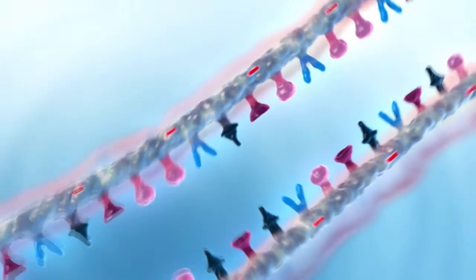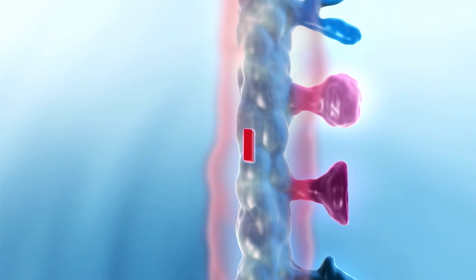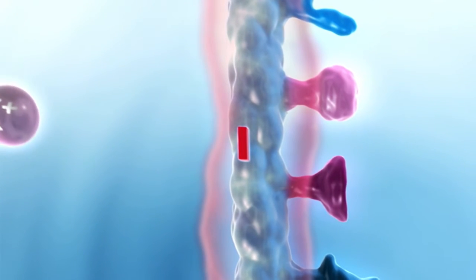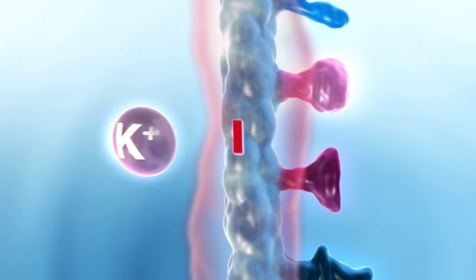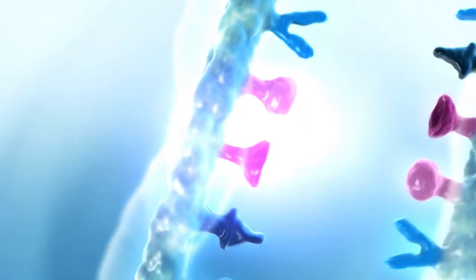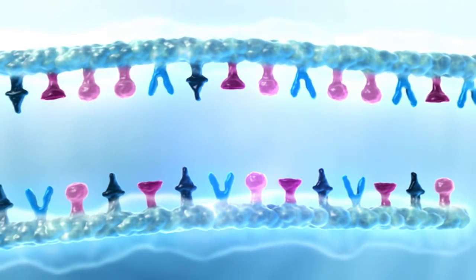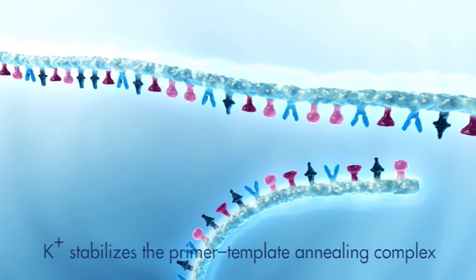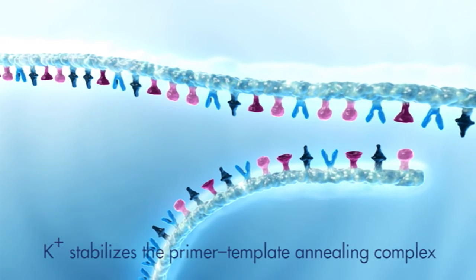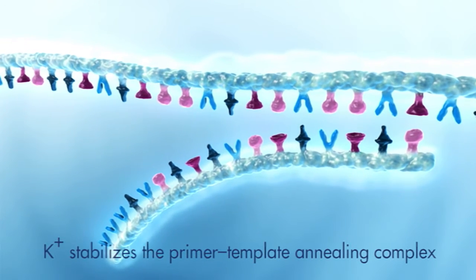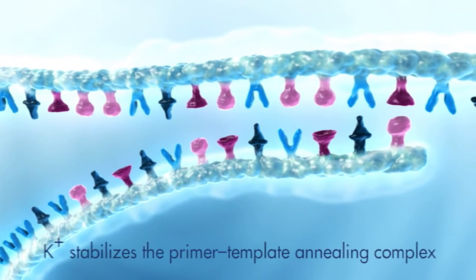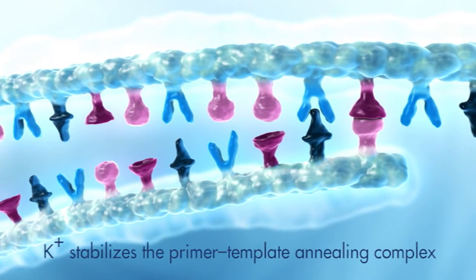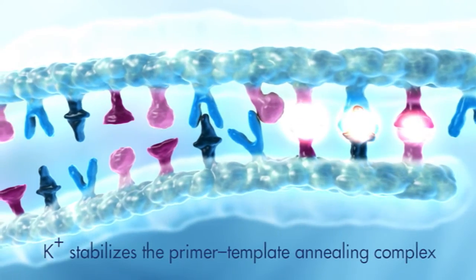How does the dual cationic formulation work? The positively charged K+ ion is attracted to the negatively charged phosphate groups of the DNA backbone of the template and primer. The charges are cancelled out. The K+ ion weakens the electro-repulsive forces between the DNA template and primer molecule. The push-off effect is overcome and the primer template annealing complexes are stabilized.